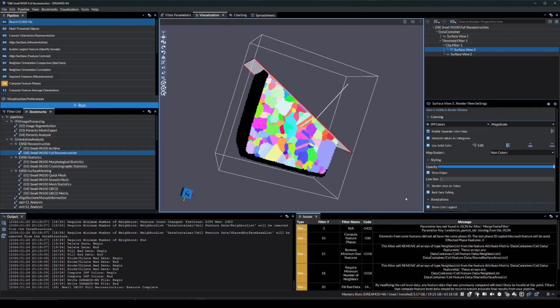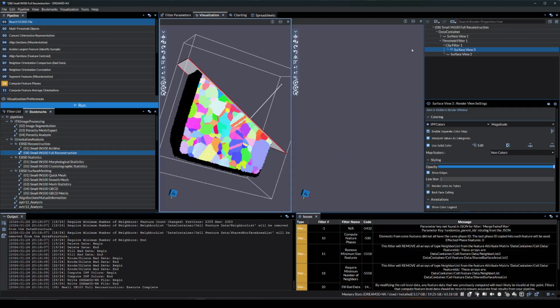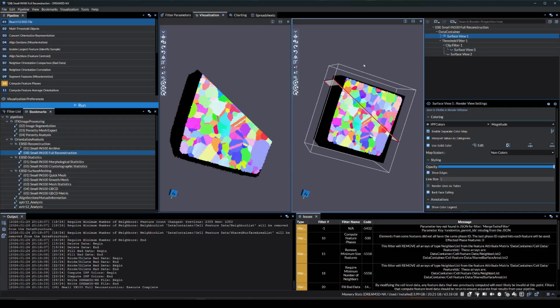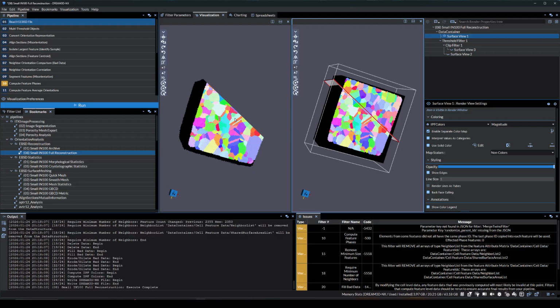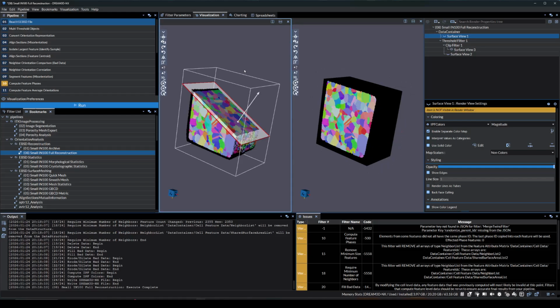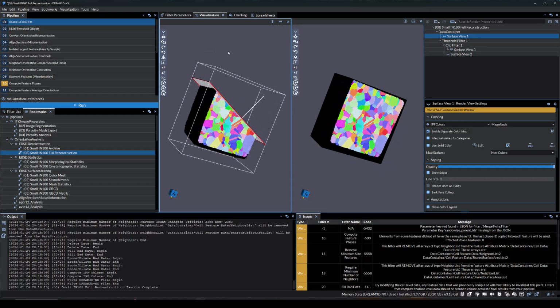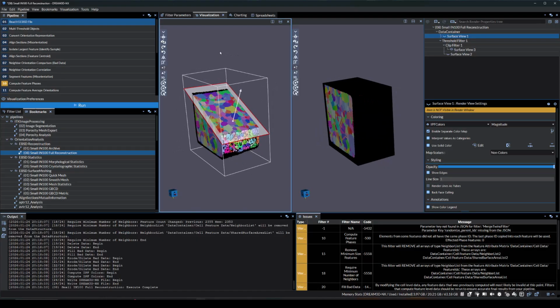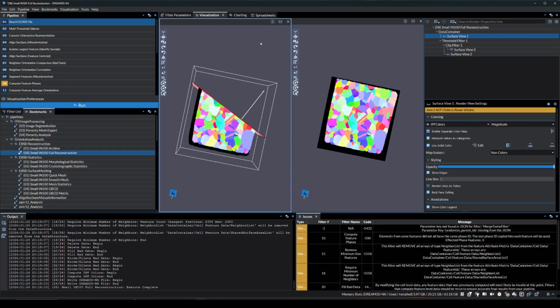Now let's add a split visualization view. Click the Split Vertically button in the visualization, then enable the desired views using the eye icon in the Render properties. Now let's link the cameras for both views and compare the geometries side by side. We can see the original geometry on the right and the geometry with 2 visualization filters applied on the left side.